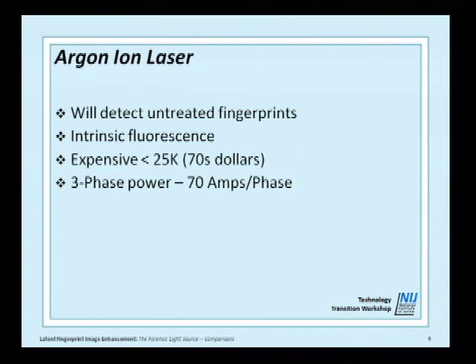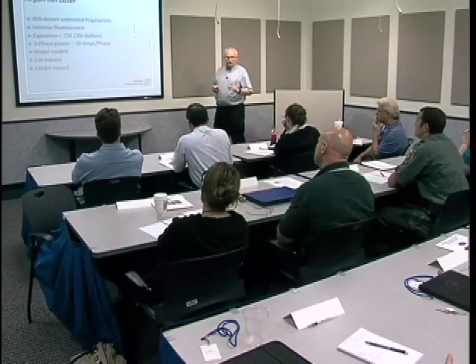Three-phase power. That big machine was 70 amps per phase, so you plug it in in the city and there's a brownout. Water-cooled, very temperamental, eye hazard, exhibit hazard.